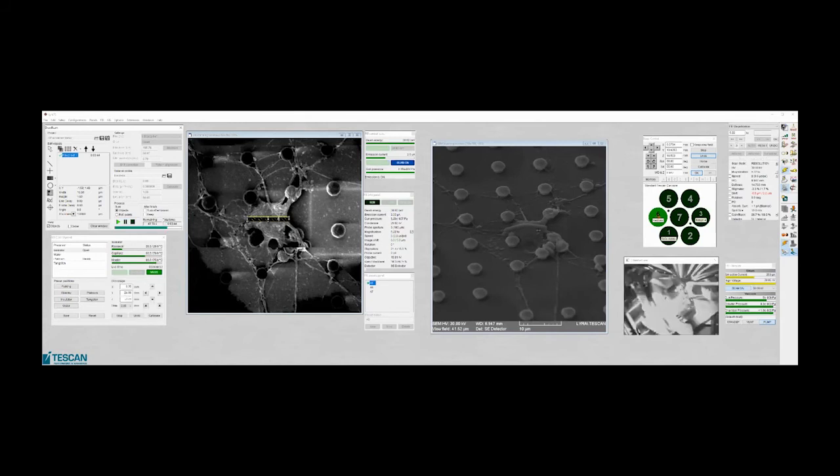For whole lamellas which we are preparing for transmission electron microscopy, we use this electron beam deposition first. And by this process, we can study even layers which are 1 nanometer thin.